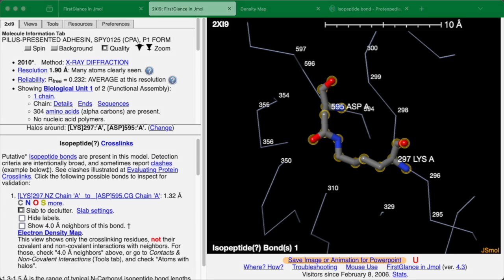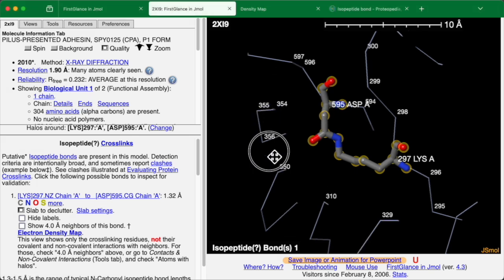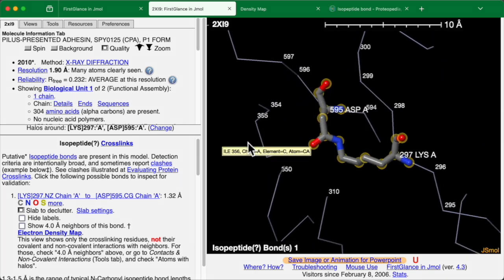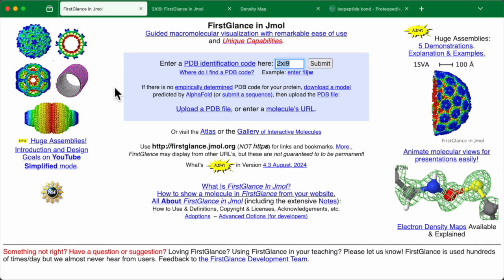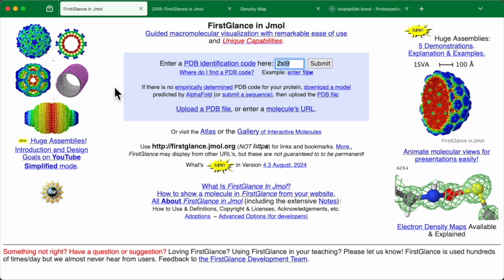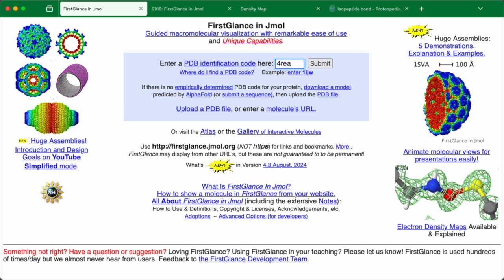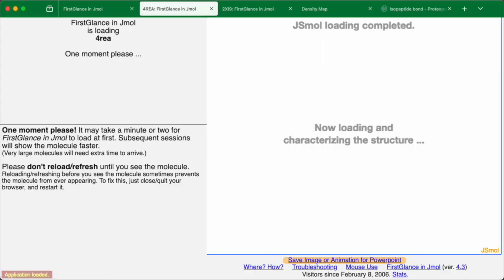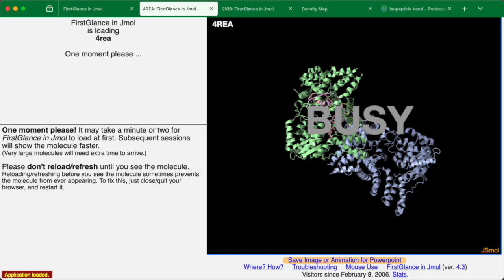We can contrast this nice example with another case where a putative isopeptide bond is not real. To do that, we'll go back and look at another molecule, namely 4REA. So I've entered 4REA in the slot here. I'm clicking submit. Here comes the molecule.